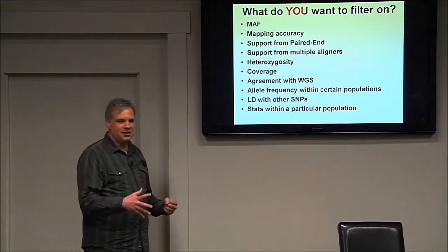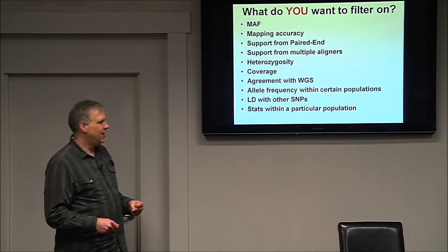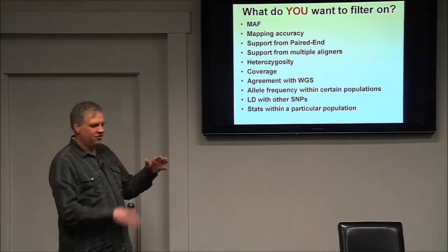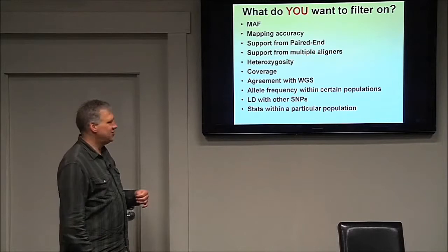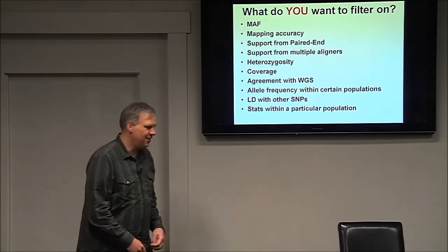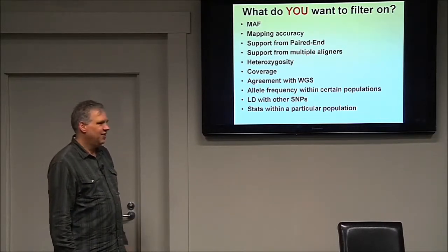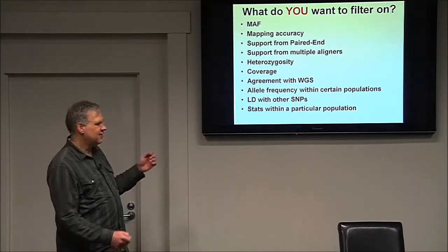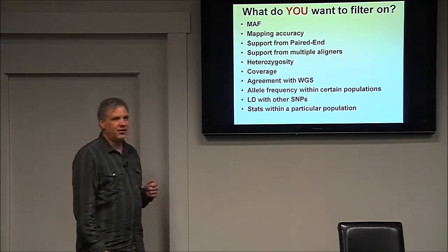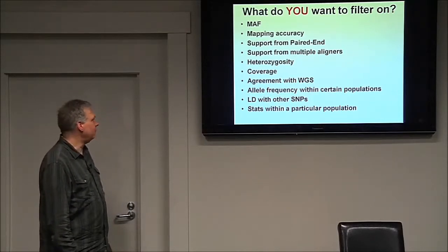The idea is to take this discovery SNP caller and, when we discover SNPs, put out all the SNPs and not really filter them much at all, and then put out all these characteristics of the SNPs in the output. Then use that as input to a machine learning algorithm, and use the NAM, which gives us a subset of things we know are good or not good, to train that machine learning algorithm to tell us how to pick out the good SNPs. So that's where we're going.